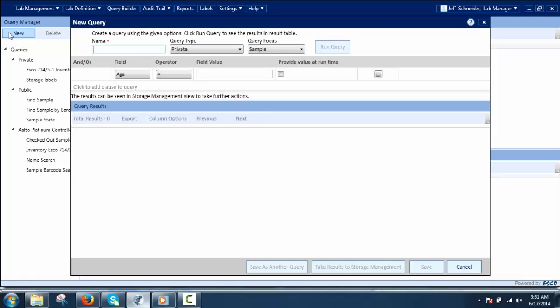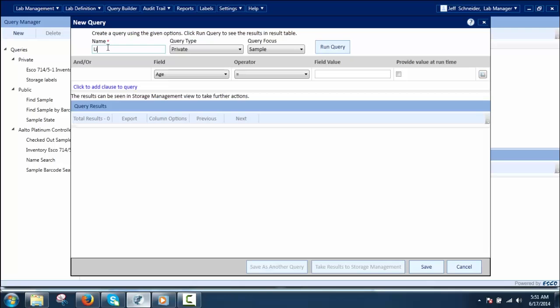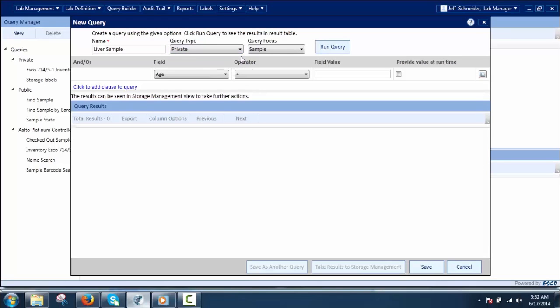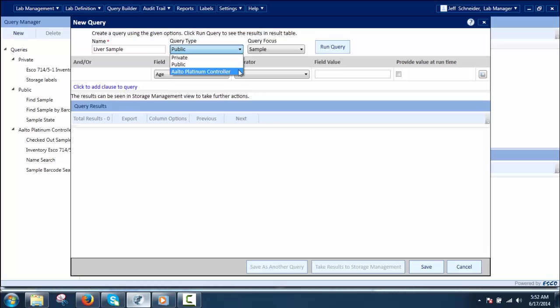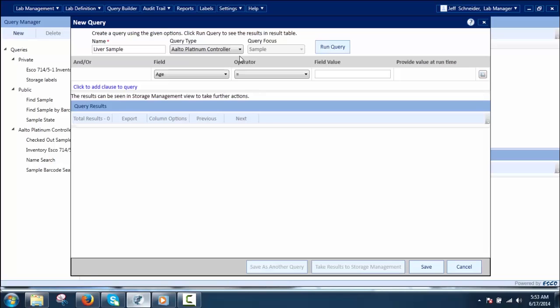To define a query, the user must define a unique name for the type selected, then select the query type. There are three query type selections: Private, Public, or Alto Platinum Controller. Private queries are user-specific — only the owner can view and access them. Public queries can be accessed and used by all privileged users regardless of ownership. Alto Platinum Controller queries are made to access the query from the freezer controller and are also user-specific, like the private query.